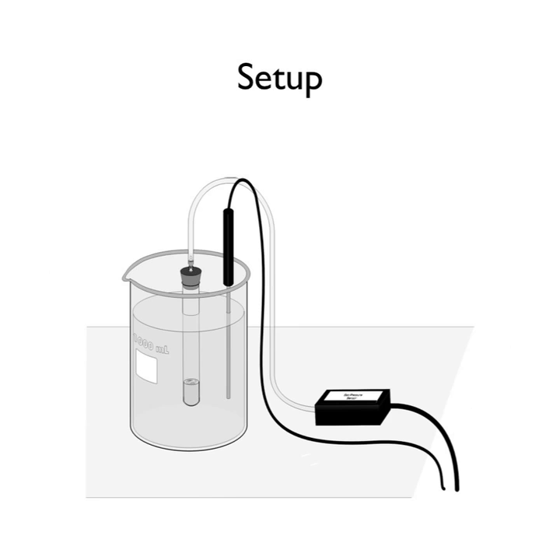Add 1 milliliter of distilled water to the remaining 1 milliliter of potassium iodide solution in the graduated cylinder. Swirl the mixture gently to mix. And then draw 1 milliliter of this new potassium iodide solution into a plastic barrel pipette. Invert the pipette and immerse the reservoir end of the pipette in the water bath. Allow both the test tube and the barrel pipette to remain in the water bath for at least 2 minutes before proceeding. And then we will collect data and analyze our data as we did in the previous part 1.